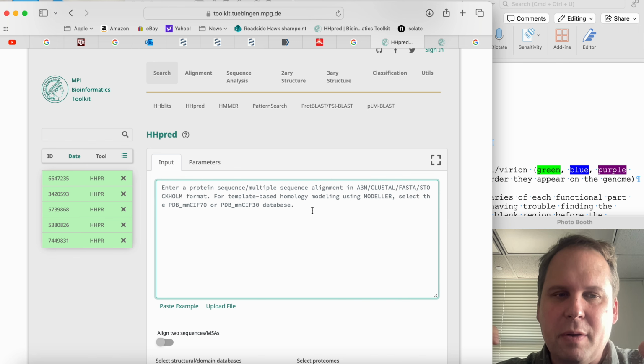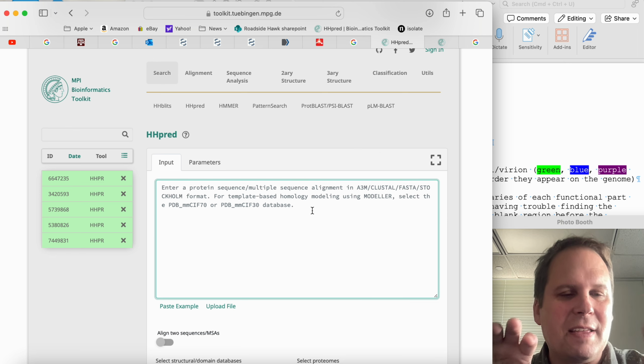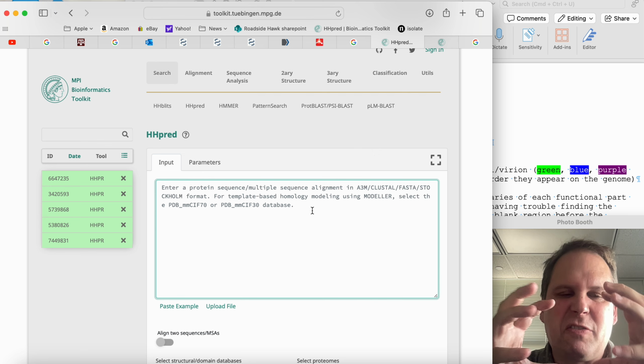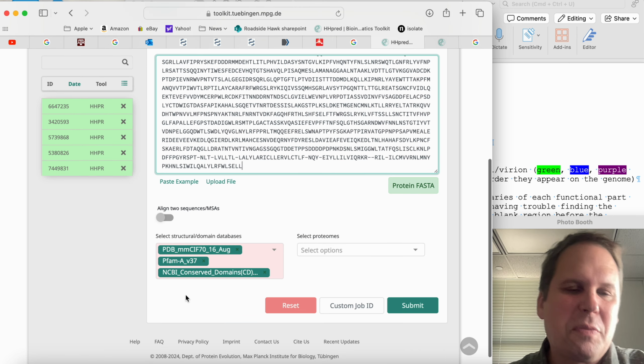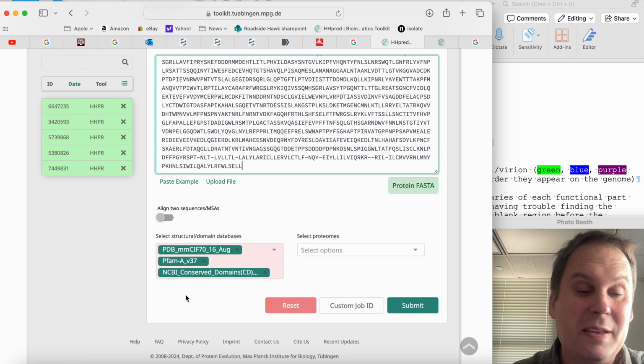And if you have a big protein, that's okay, because there are probably different parts inside of it that do characteristic things. We call these parts domains. It's like a part of a protein that'll fold up and work on its own. It'll do something on its own or make a shape on its own. Yeah. So dump those in here. And there are 3 really good databases, and if you've searched these 3 and you don't find any explanation for your protein, there's probably no explanation for that part of the protein.